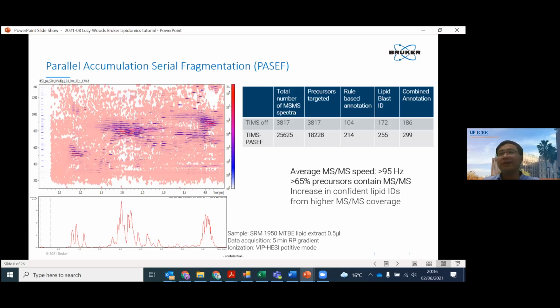So I will just read the question. The metabolomics community tries to come up with means to calculate confidence, meaning the likelihood that an annotation could be wrong, to calculate FDR values. So was that a question or a comment? It is a question: can you calculate FDR values? I don't know. Maybe he asked you. Oliver, do you want to, or is it just a comment?